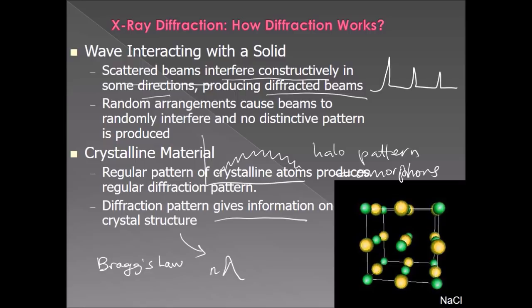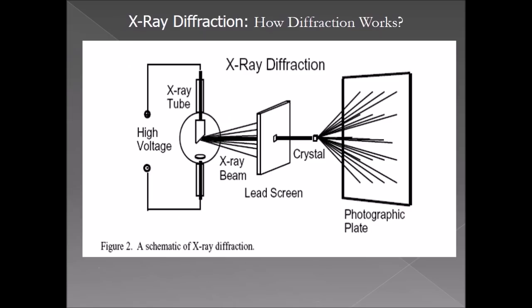The equation of Bragg's law relates the wavelength, lambda, to 2d sine theta. So you have the theta, and you know the wavelength of the X-ray. So whatever you don't know is just the d. What is d? d is the spacing of the crystal, from here to here. So if you know the spacing of the crystal and the angle, perhaps you can actually imagine the real structure of the crystal.